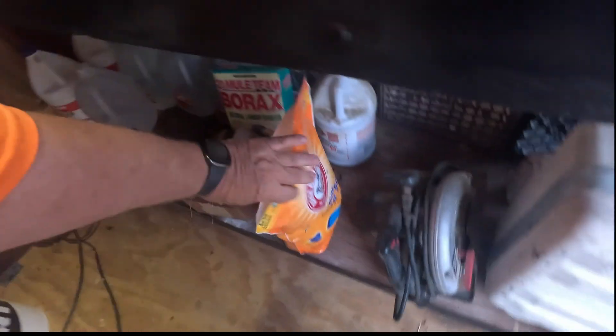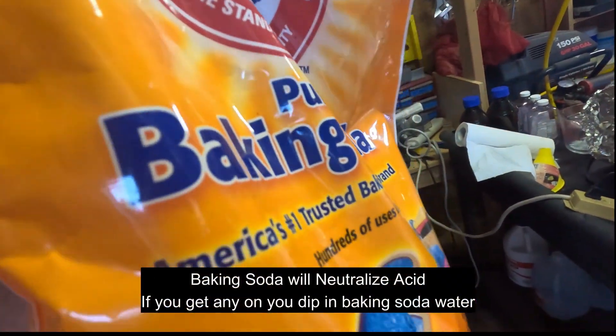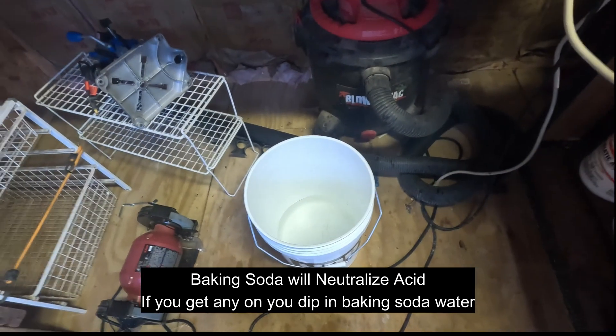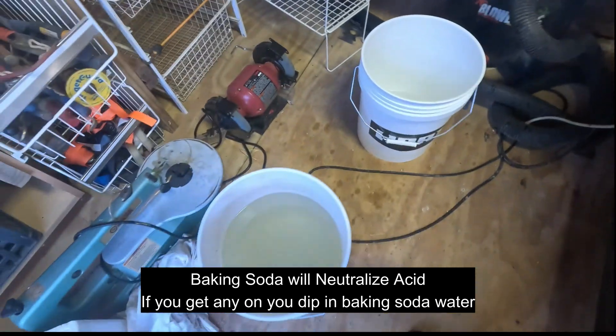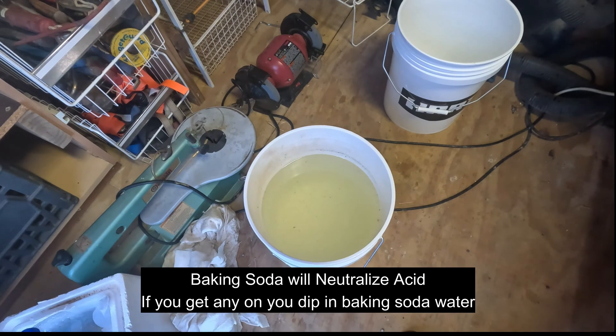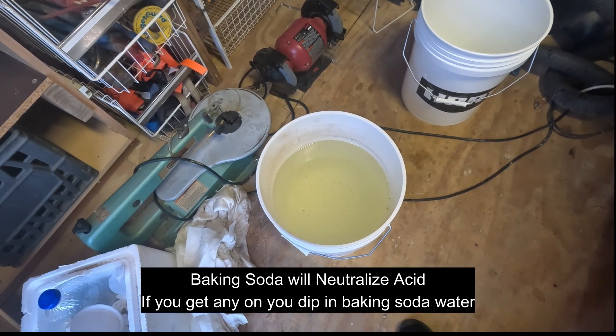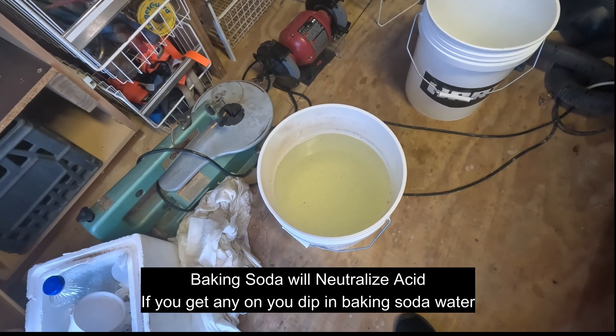Another thing you'll need to keep on hand is baking soda in a big bag when you're dealing with acids. I keep one bucket full of baking soda water, and then this bucket here is full of baking soda water that I've already used to neutralize acids when cleaning my flask out.